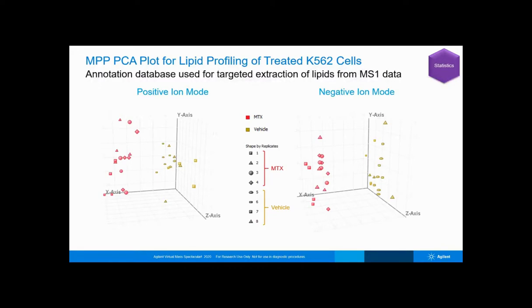If you remember, there were 4 replicates each from 4 cell culture plates in each condition, which are indicated by symbols. We didn't see a separation here based on cell culture plate, and this indicates to us that really the drug treatment appeared to be the dominant variable responsible for the separation.